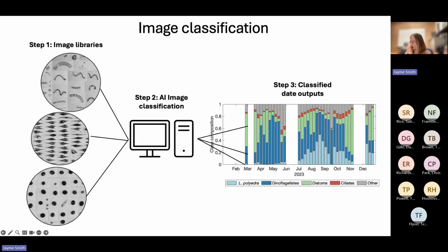So this is a plot from a couple years ago where we were really focused on Lingulodinium polyedra, and everything else we binned into the higher level taxonomy. But you can track different taxa over time that you're interested in, and look at whether it is increasing or decreasing, and start to get nice images like this where you learn about the temporal trends in a given taxa that is being identified.